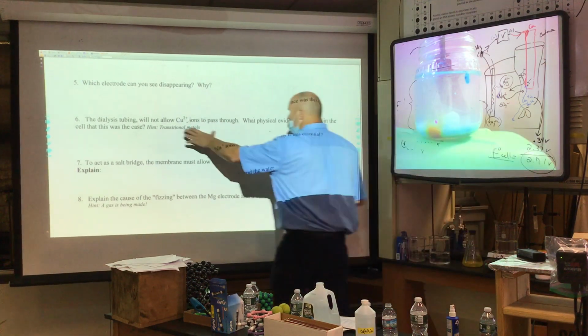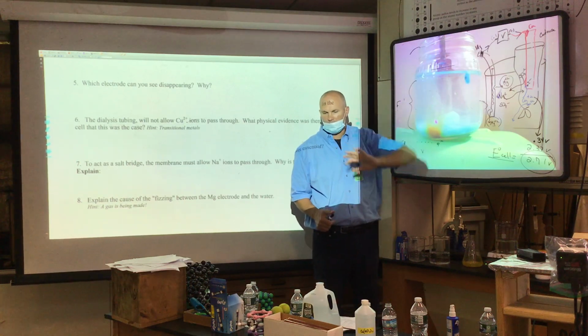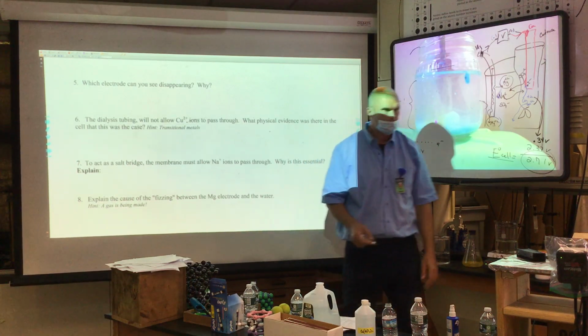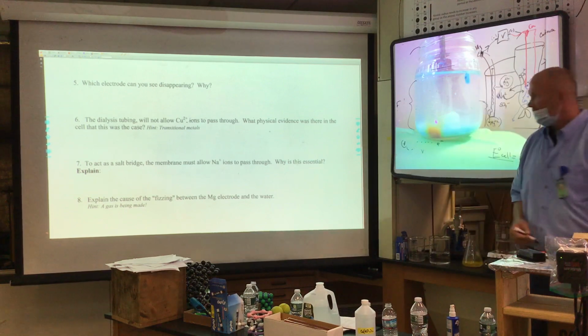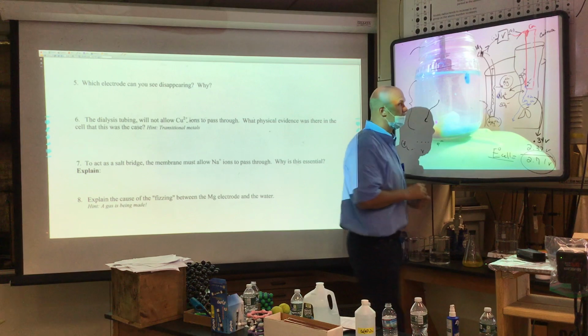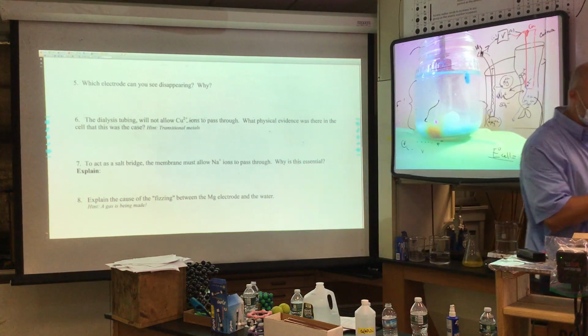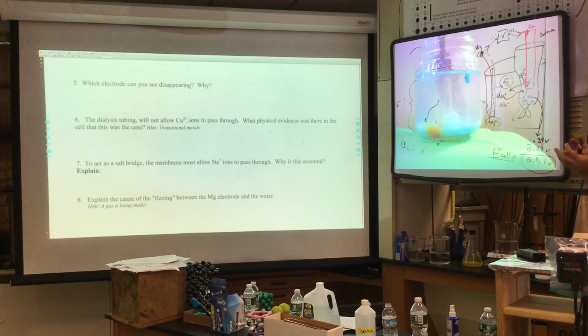There's a reason for that, and transitional metals have color. But there's a reason for that we'll learn called crystal field splitting or crystal field theory. So clearly the copper plus 2, wherever that bag was escaping. Okay, just like I said. Why? From high concentration to low. Why? Because you're going from a place of concentrated source to less.